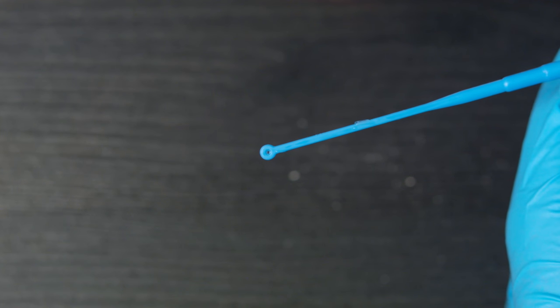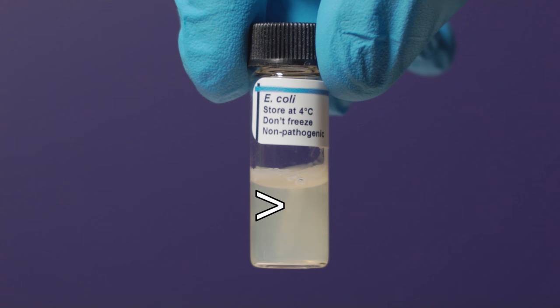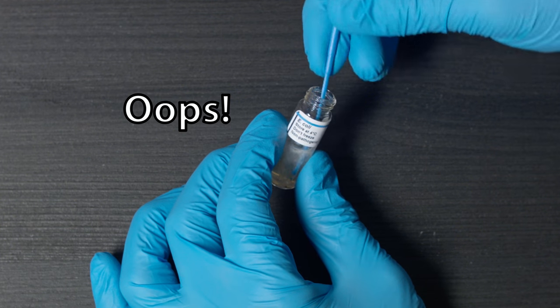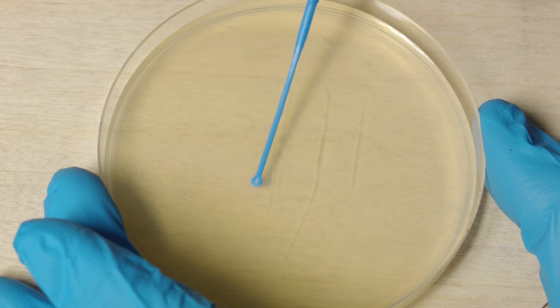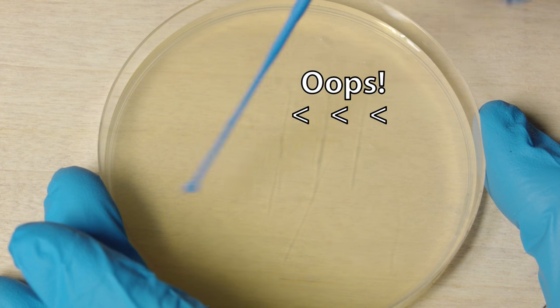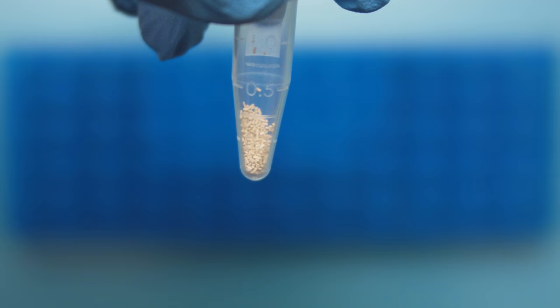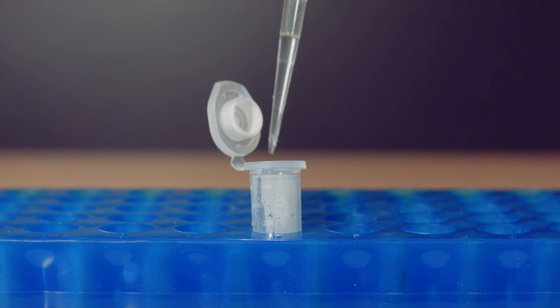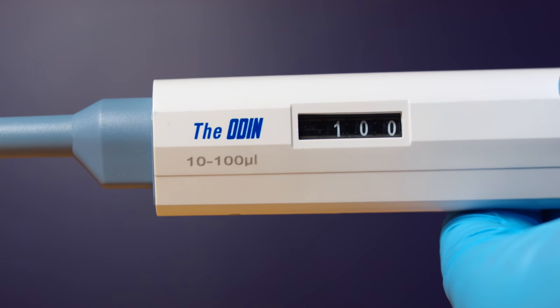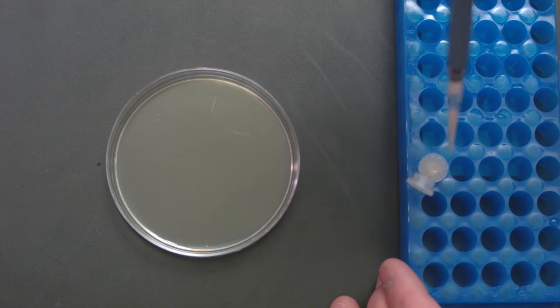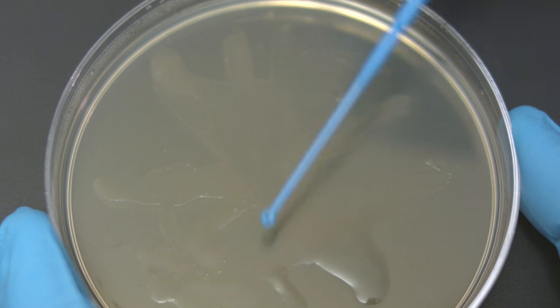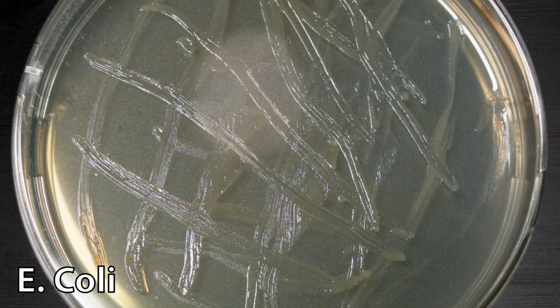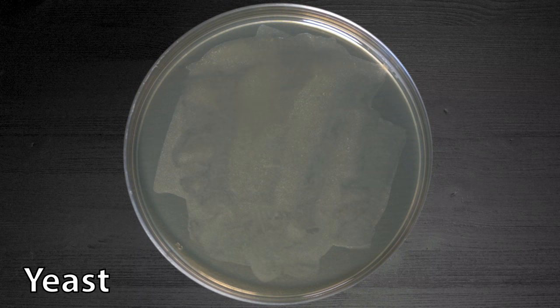Using an inoculation loop, collect the E. coli from the bottle along this faint white line called an agar stab. Wildly spearing the agar is inadvisable and ineffective. With the loop flat against the agar, gently streak out the bacteria on the LB agar plate. Try not to pierce the agar. Add water to the top of one of the tubes of dried yeast. I was being cautious and used the pipette for this. Shake the tube until the yeast has dissolved. Set the pipette to 100 microliters and grab a tip. Pipette out 100 microliters of the yeast solution onto a YPD agar plate and carefully streak out the yeast. Allow the E. coli to grow overnight for about 12 to 18 hours and the yeast for 12 to 24 hours.